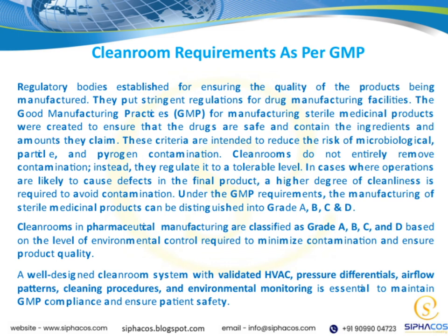Finally, a well-designed cleanroom system is crucial. This includes validated HVAC systems, pressure differentials, airflow patterns, cleaning procedures, and ongoing environmental monitoring. All these elements work together to maintain GMP compliance and, most importantly, to protect patient safety.